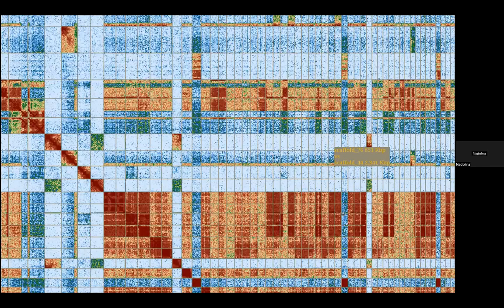Let's get rid of the coverage here. So these obviously are larger scaffolds that you can see along here. And we call this shrapnel, just larger scaffolds that did not get assembled by the assembly algorithms, but you can see that there's still some interaction here. So not all of this will you be able to assemble. If you're looking at it, a lot of it is interacting with each other. And depending on the assembly, you might also find that it interacts with a lot of other pieces as well.